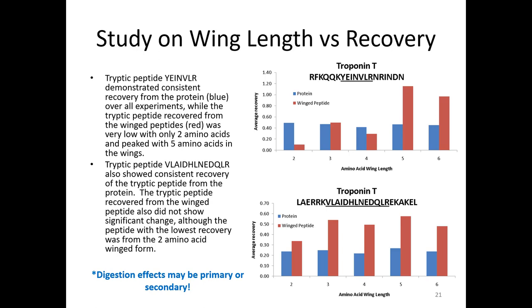So then we had 2 different people repeat it, and they got all different results. So the point of this story is just be careful with what you're calling your standard. Whatever it is, you need to make sure it's reproducible in how you use it, but coming out with a quantitative answer at the end of what you're doing, I would just be very careful.